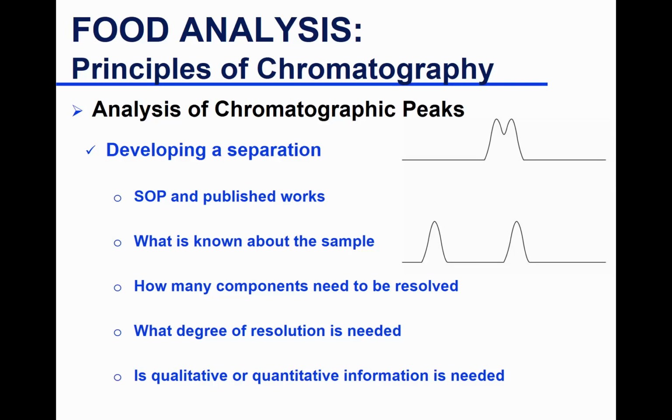All right, so now that you have learned the different types of chromatography, you have liquid chromatography, gas chromatography, supercritical fluid chromatography, and also you learned about the different modes of separation: ion exchange, cation, anion, etc., hydrophobic interaction chromatography. So now you have a solution and in it you have components that you have extracted from a certain food product.